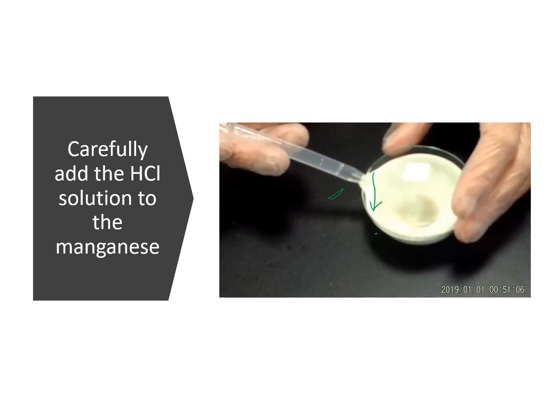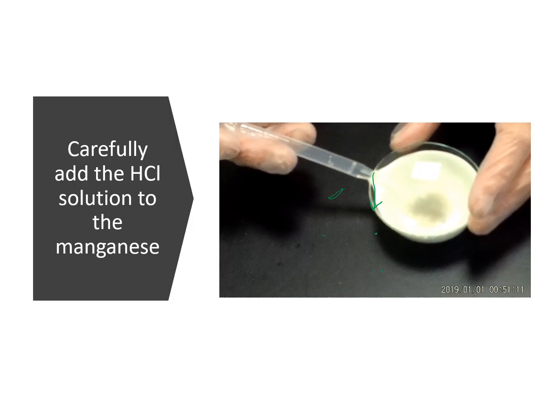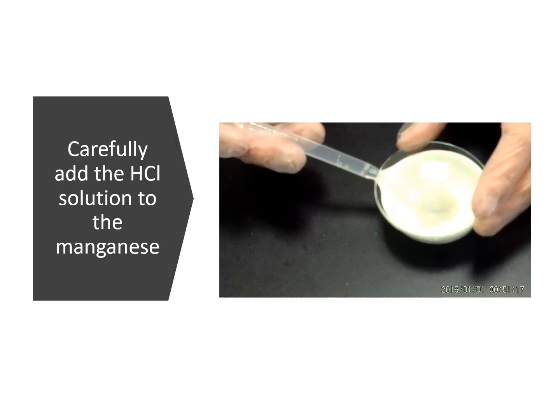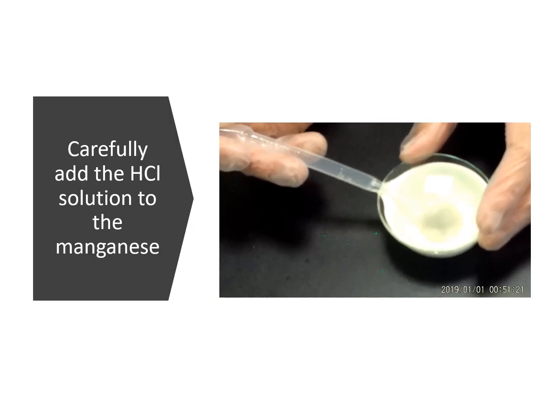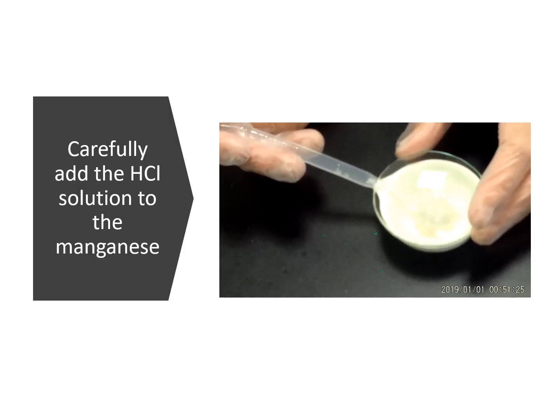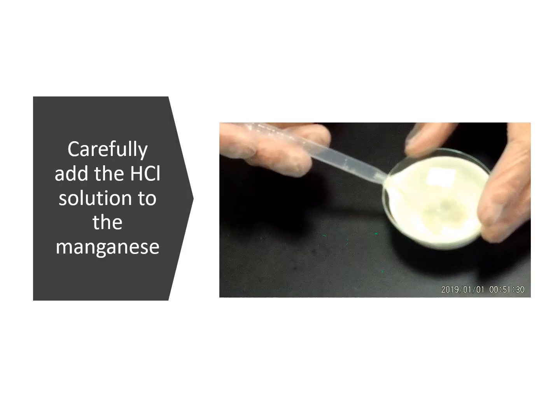And how do you know when the reaction is done? You're going to look for the absence of bubbling, because the bubbling is you forming hydrogen gas, and that's why you're seeing the bubbling occur. So you're going to look for the absence of bubbling, and make sure that all of your solid manganese has dissolved.